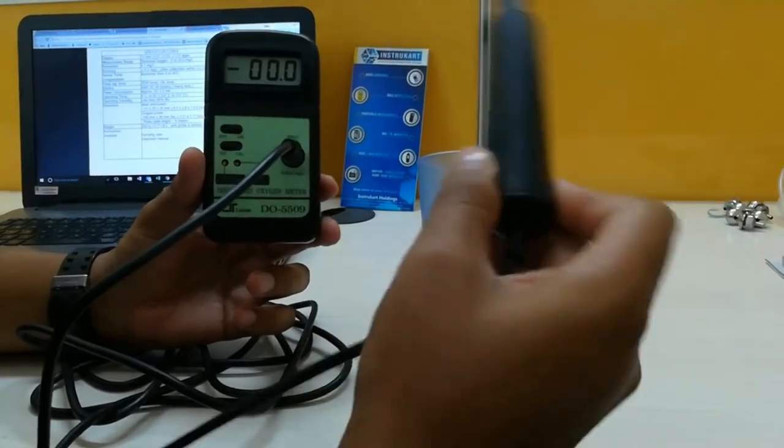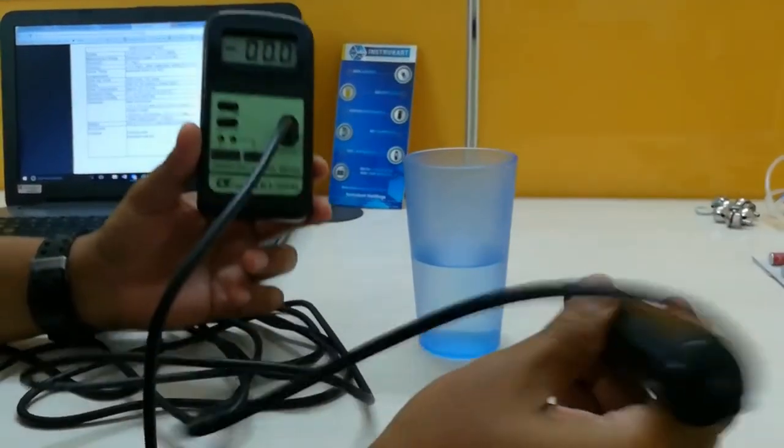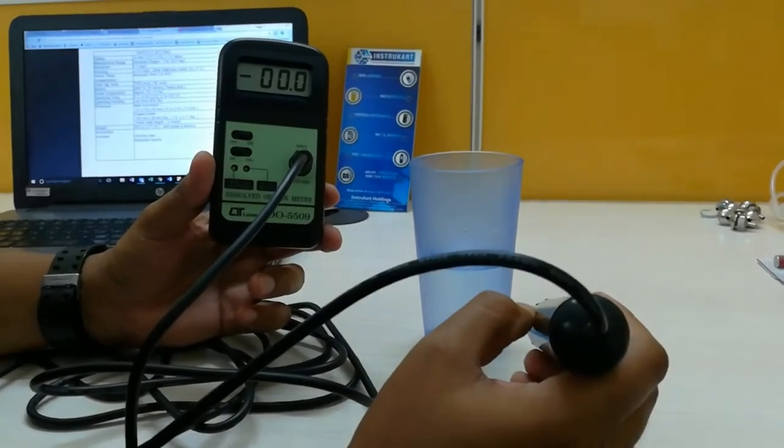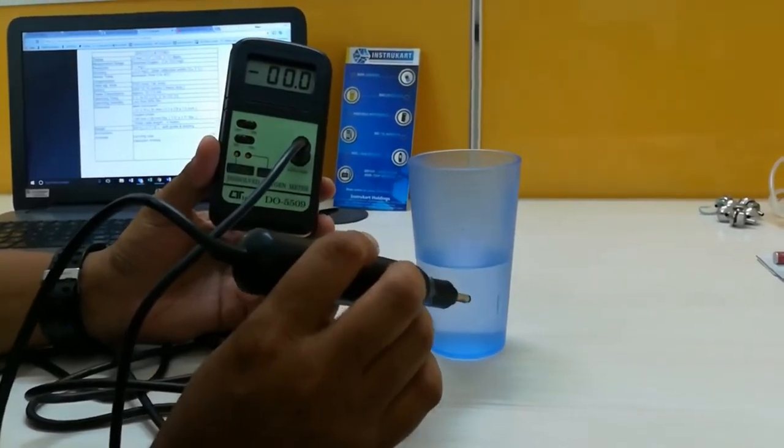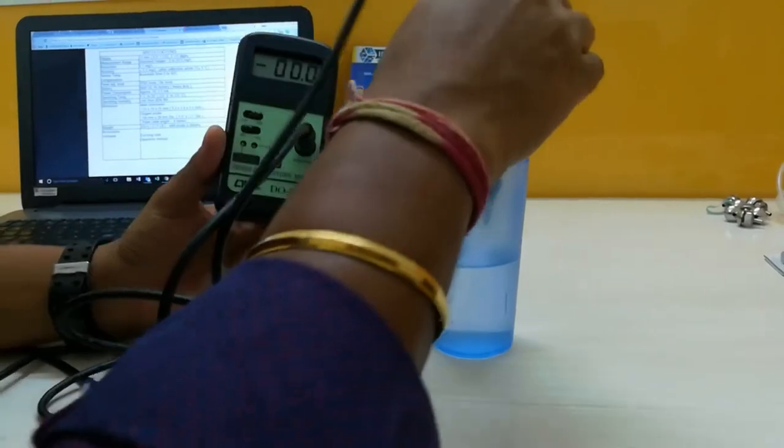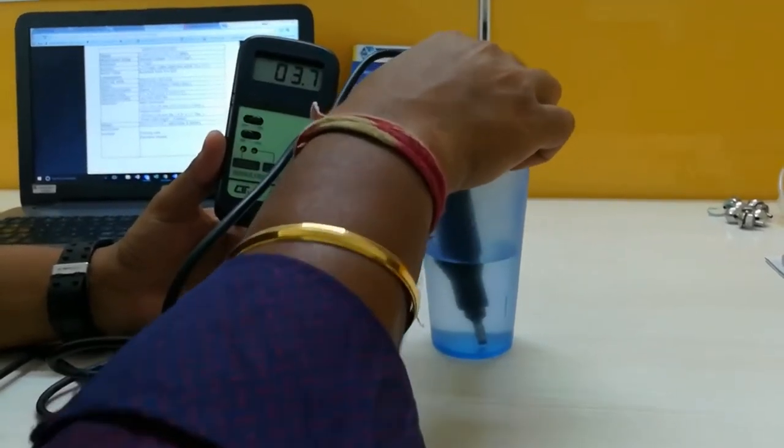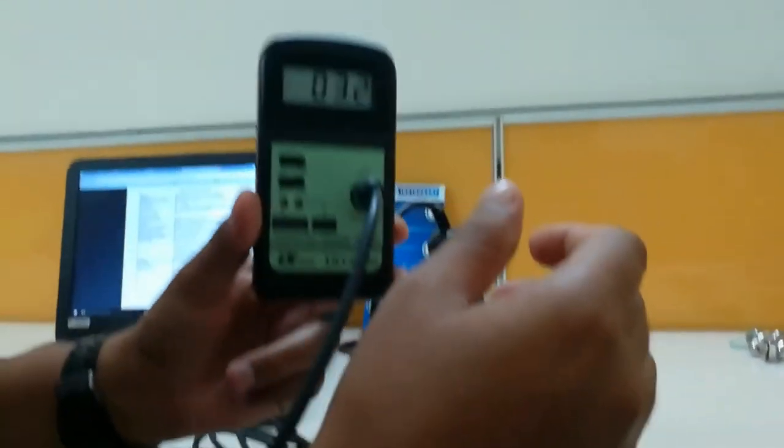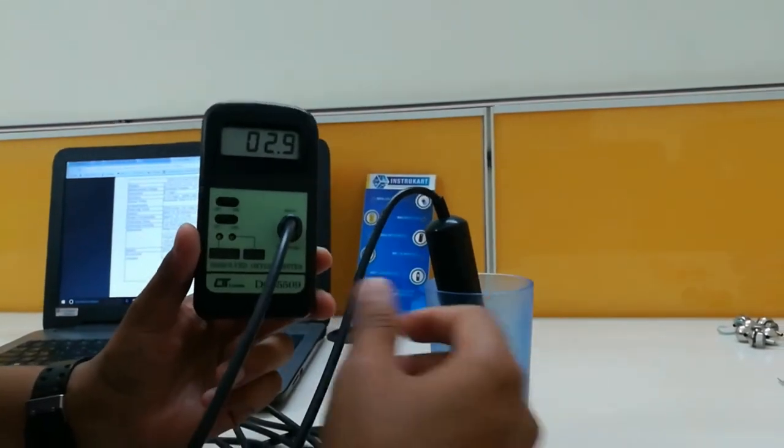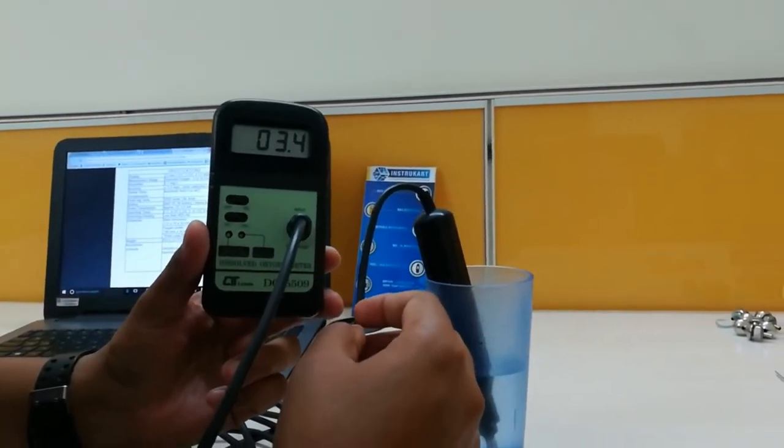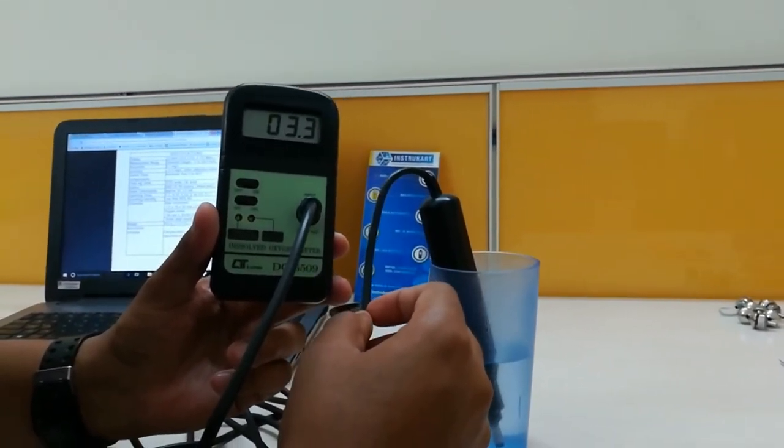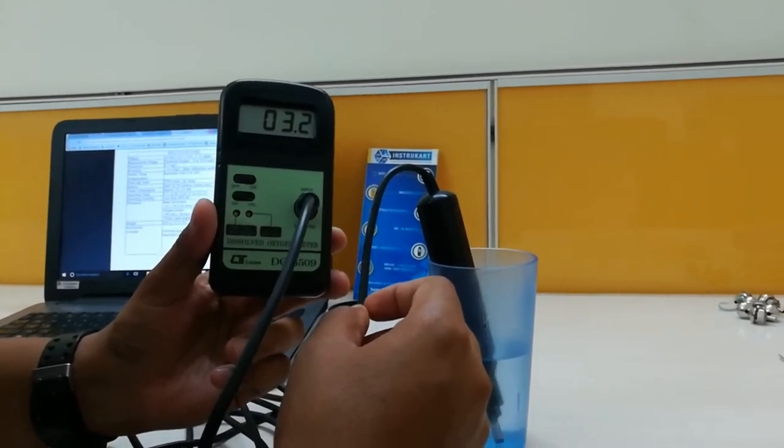We'll have a look at how the dissolved oxygen changes if we put it in a glass of water. This is fresh tap water and we'll see the change. You can see the dissolved oxygen level has changed to 3.3 mg per liter.